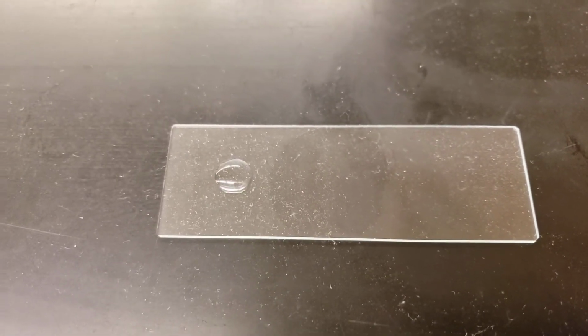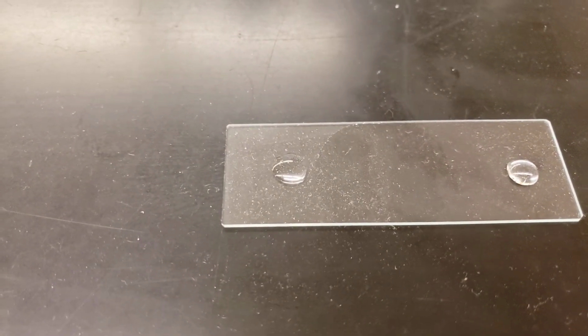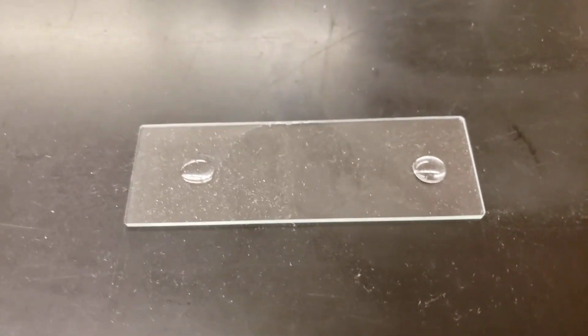Now you can see the difference already. Our water droplets stayed nice and together, while our alcohol droplets spread out. We have one more. We also have our glycerin droplet, and we put one droplet of glycerin on there. And we can see that the glycerin droplet stands up even more.